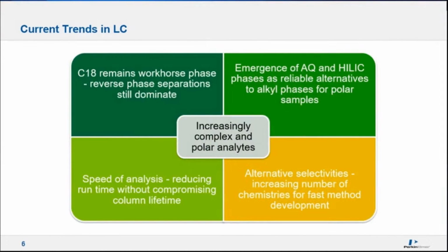These are some of the current trends in LC. In the center, we can see that we have increasingly complex and polar analytes. In order to tackle this, C18 remains the workhorse phase, and reverse phase separations still dominate. However, there has been an emergence of high aqueous phases as well as HILIC phases for reliable alternatives to alkyl phases for the separation and analysis of polar compounds.